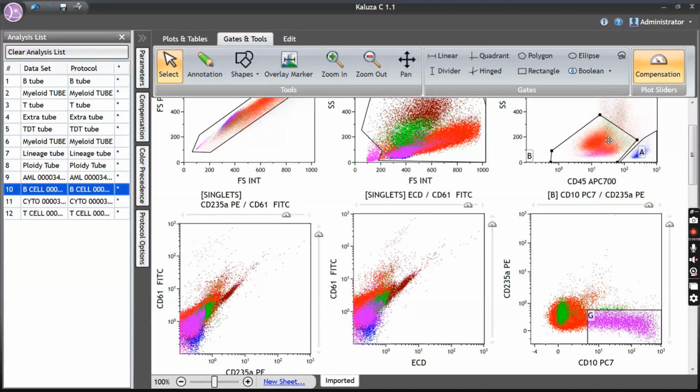But here, as far as my analysis is concerned, the predominant markers are positive in both and are similar in both the blast populations. So I don't do that. Of course, the CD10 is more on the low side scatter blast. The other question is, can you drop the quadrants for MPO and cyto-CD3? Okay.